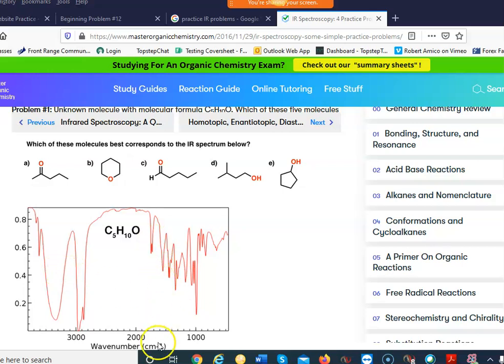That's pretty much it. This is, let's see, 2,000. That might be a little too low. Let's see, that's about 1,800. That could be a carbonyl. All this stuff we basically are going to ignore. But yeah, possibly I can have a carbonyl. However, I really can't have a carbonyl, because of the fact I only have one oxygen, I have to have this alcohol here. These peaks, I think I told you, sometimes it could be water. So if you see little extra peaks, it's water. But based on the structures here, what possible structure can it be?